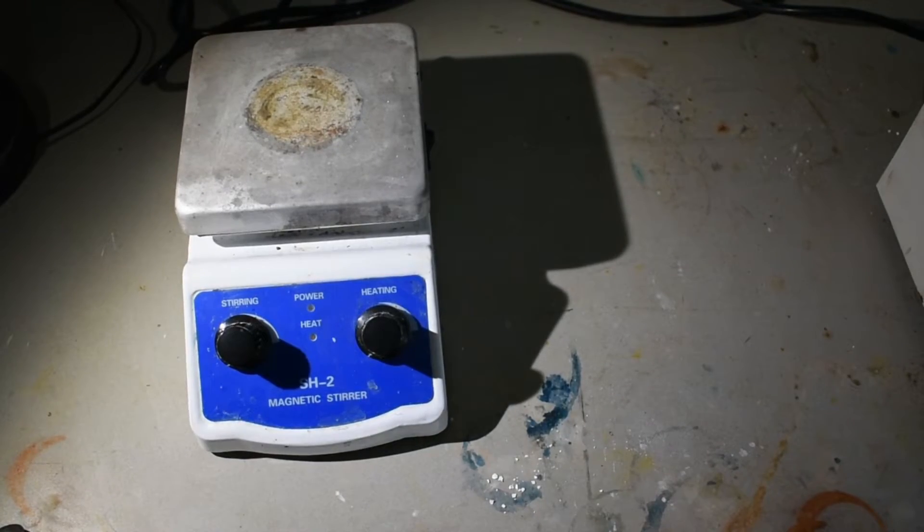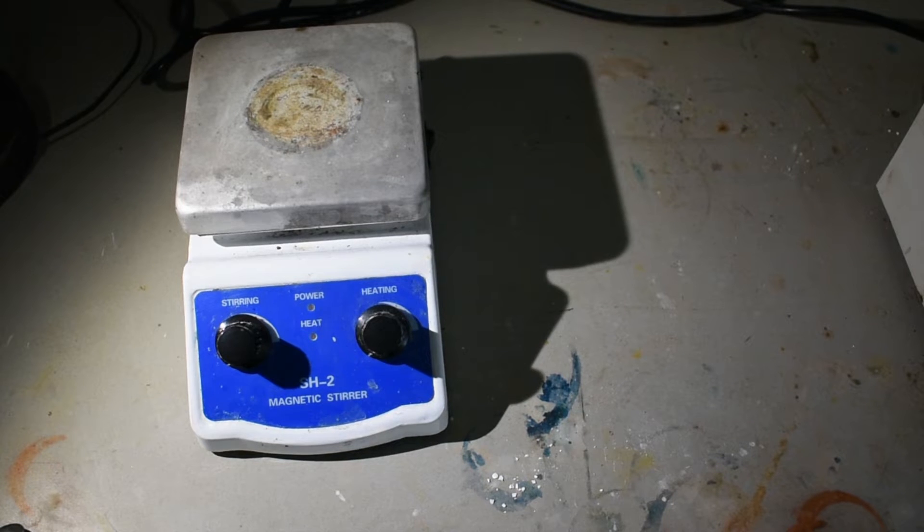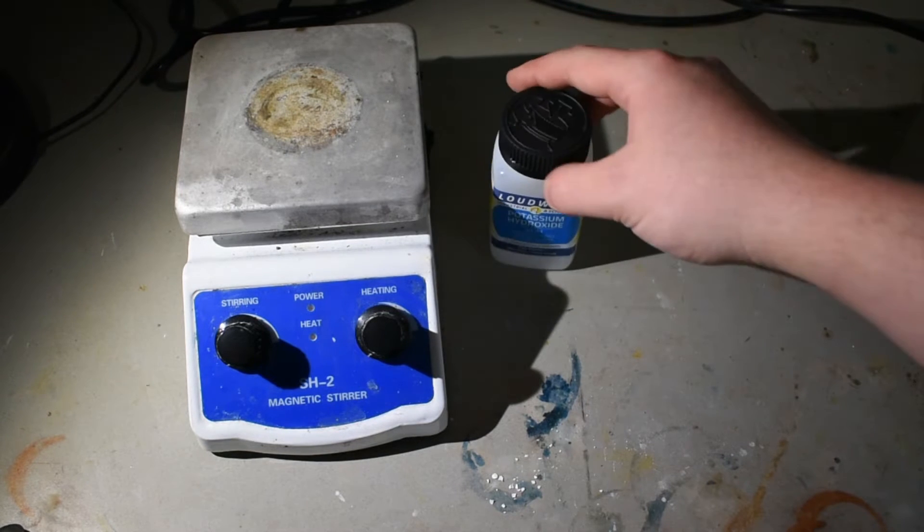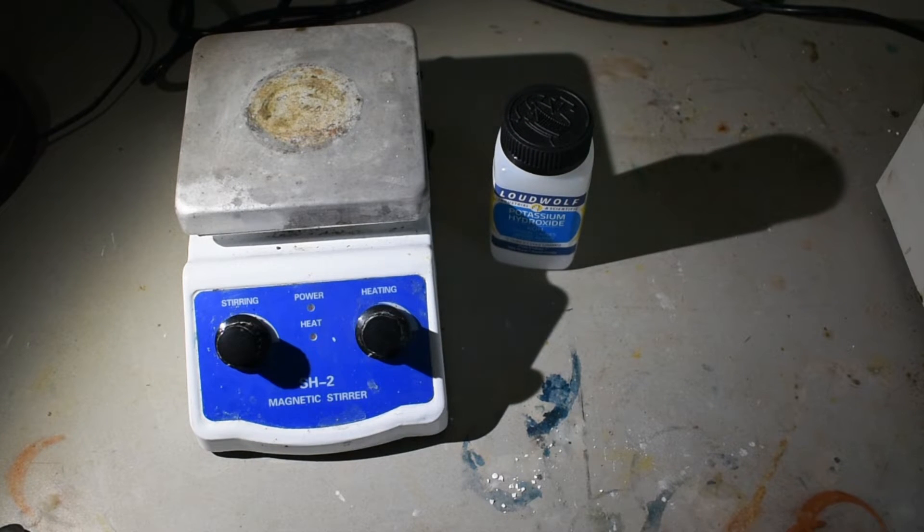Okay, another quick inorganic preparation. This time, barium peroxide. So what we're going to need is some potassium hydroxide, and we're also going to need a source of barium. In my case, barium nitrate.